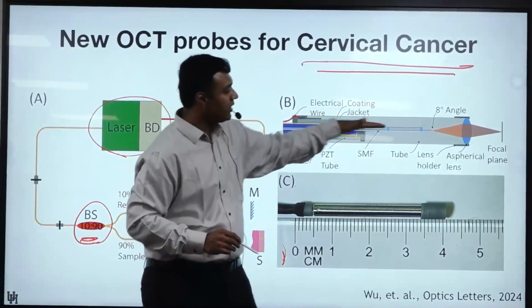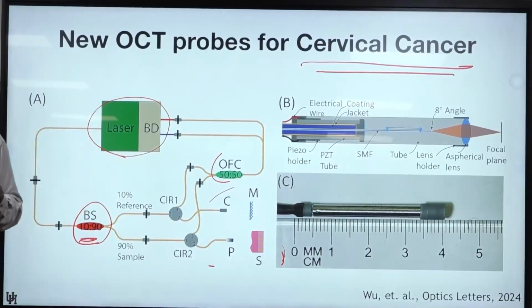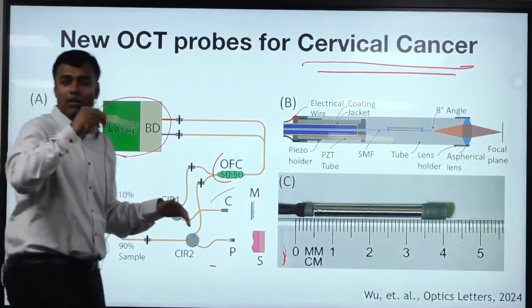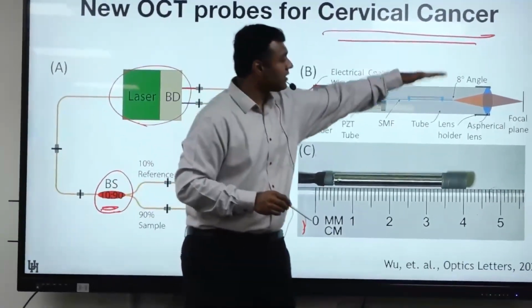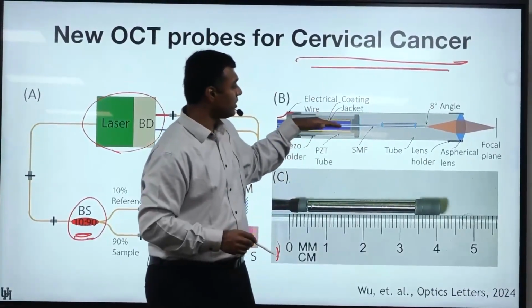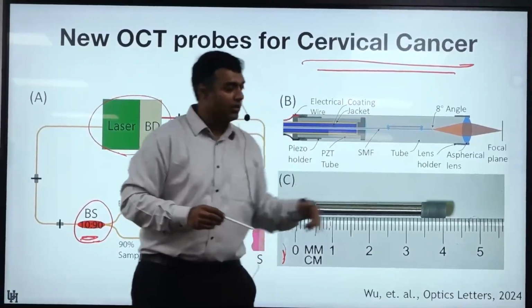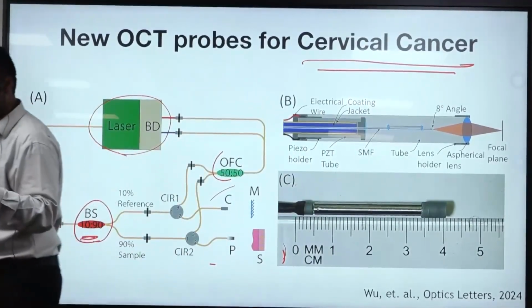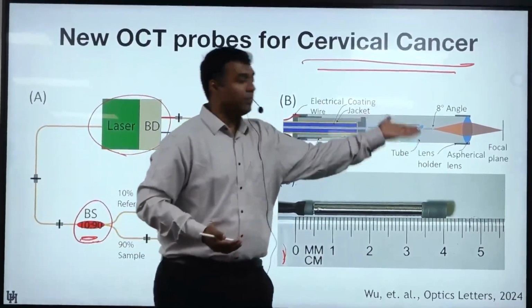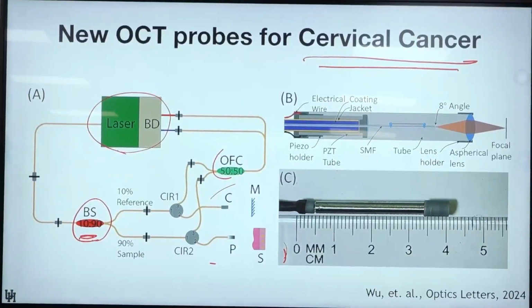If that is at resonance with the resonant frequency of the fiber, then it will start amplifying and oscillating a lot. So it results in a large amplification. Even if this moves a little bit, the other end, because of resonance, gets amplified to millimeter scales. So this deflects by millimeter size distances.